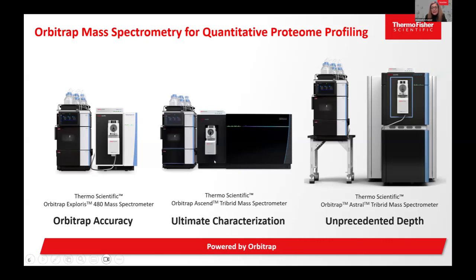In the center is the Tribrid, the new generation being the Ascend, which practically has a linear trap. That means if you need a higher level of sensitivity from the linear trap, you have the option to run the method on it, right? And indeed, there was a lab in Spain that did DIA using the ion trap for low sample input, which to me was really interesting, but I never tried it myself.